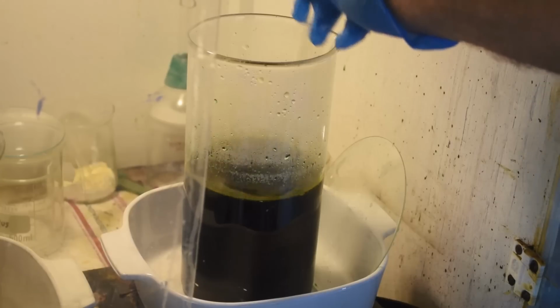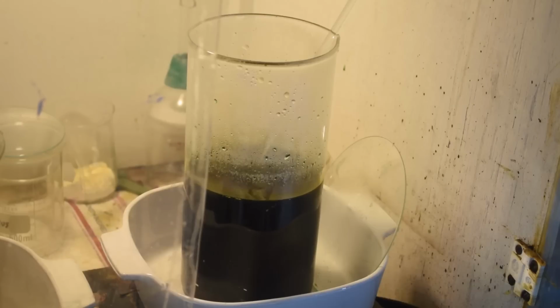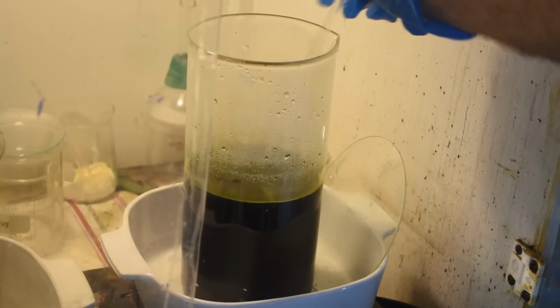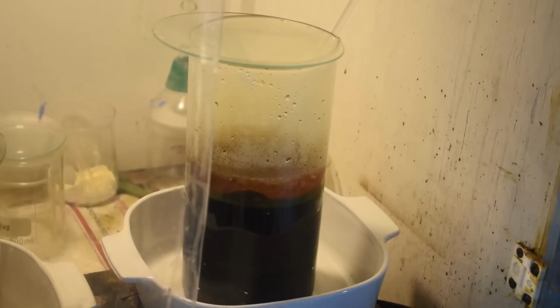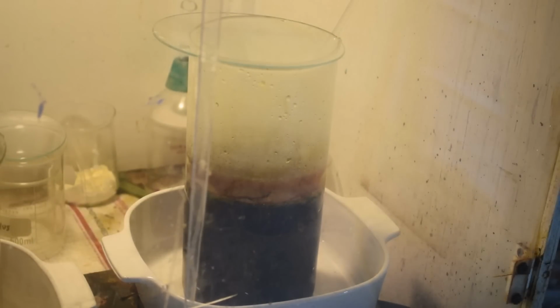Now this is about the most dilute of all, this last batch here, so I'm not expecting a spectacular reaction. I'm thinking if we just wait. In fact, yeah, it's going red. It's going red. Okay. There it goes. Yeah, a little bit of a delayed reaction. This was a little bit more dilute than some of the others, but it finally took off. So, alright. I don't care if it takes its time. I don't have time to filter today anyway. Make sure the heat's off. And I am going to escape while I can in the break in the rain here, and then come back out when it's done, or tomorrow, or the next day, and finish filtering this stuff.